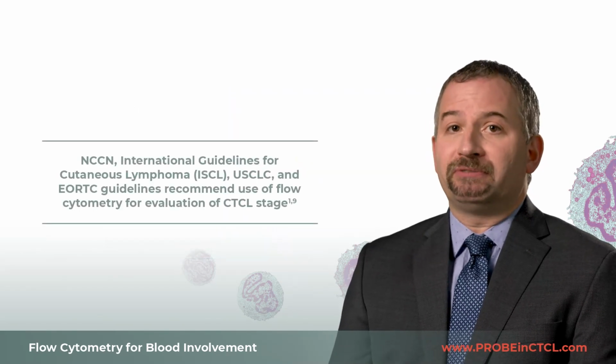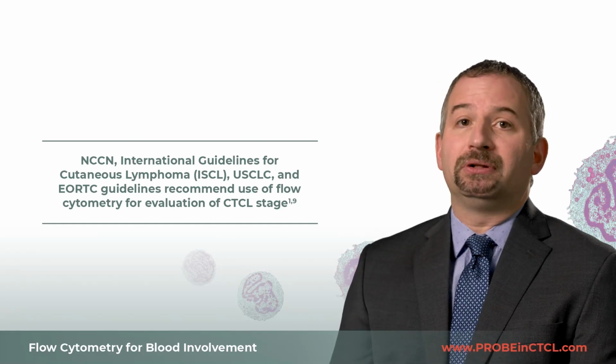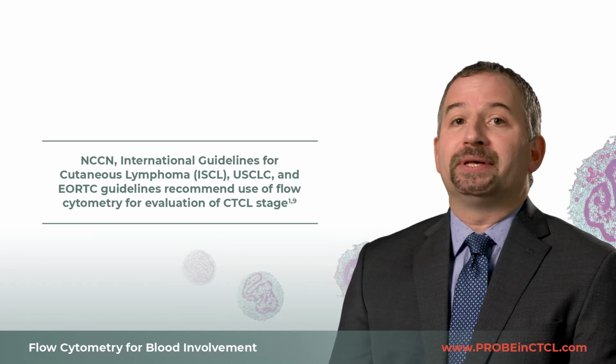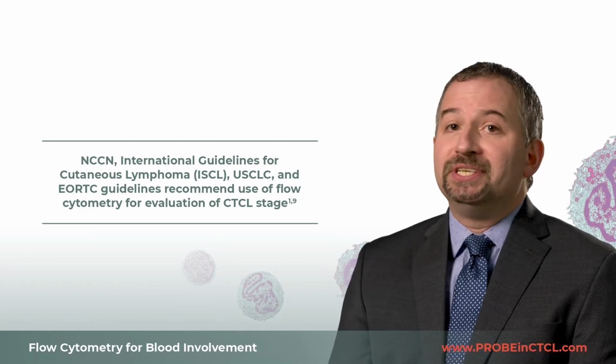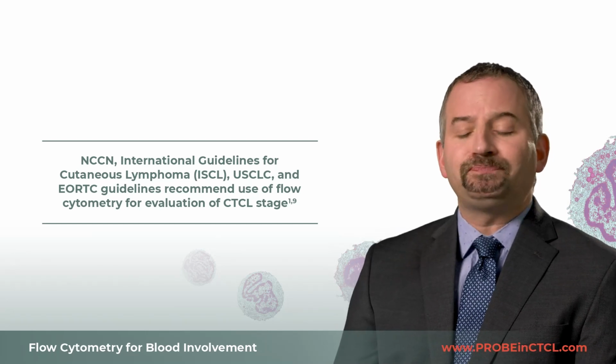For all these reasons, flow cytometry is recommended in the US and international guidelines, NCCN, ISCL, USCLC, and EORTC for evaluating blood involvement in patients with CTCL.